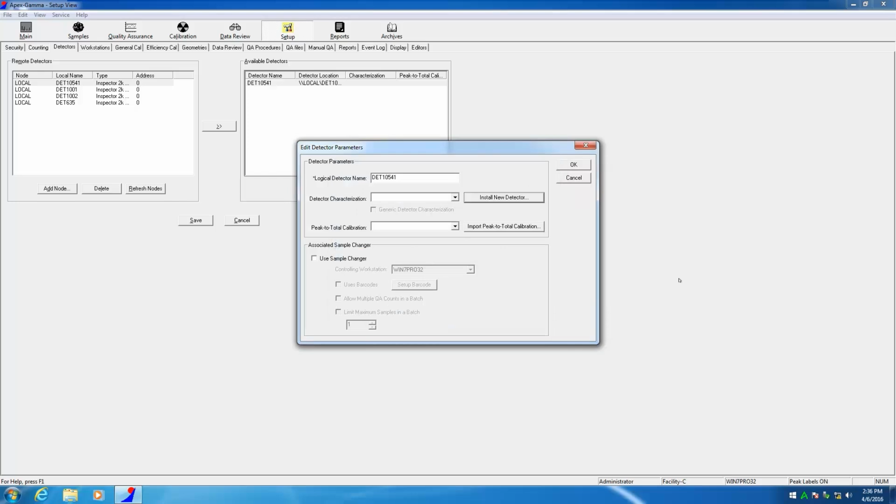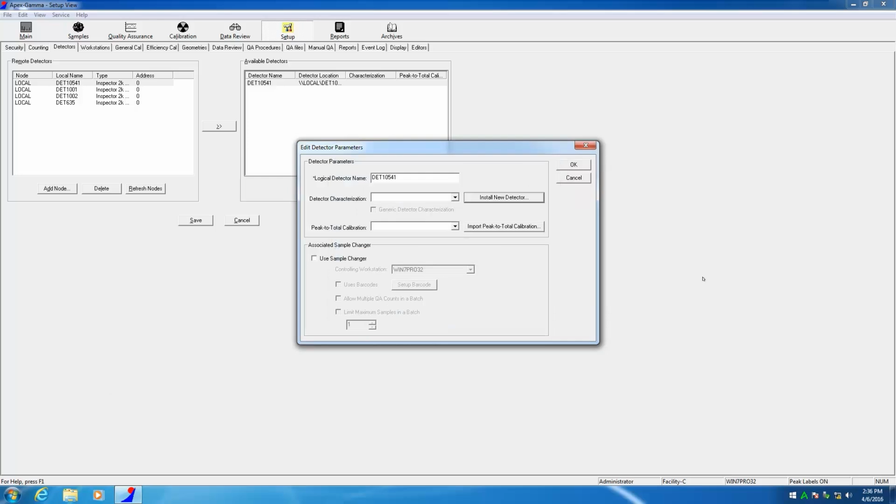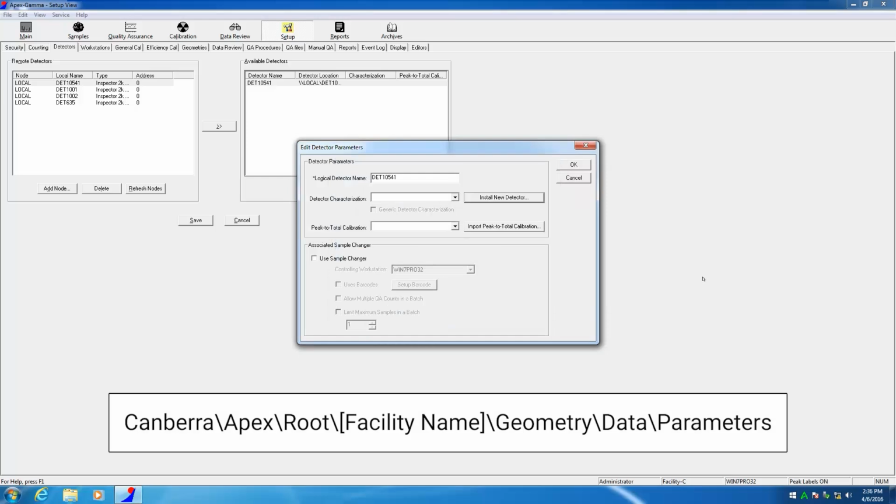Following the update performed by the utility program, the detector.txt file in the folder here will now include the required information for detector 10541. In addition, the associated ISOCS-LABSOCS characterization file, named 10541.par, will now be present in the folder here.